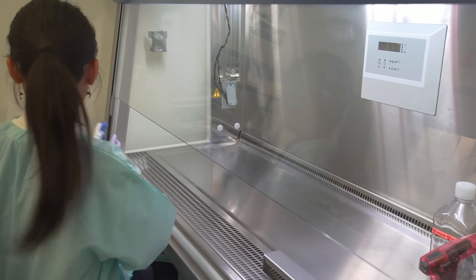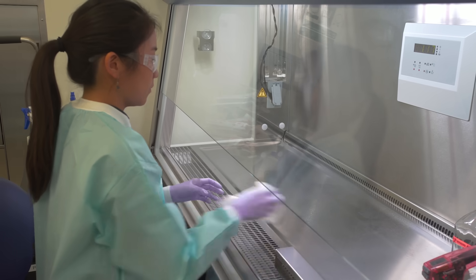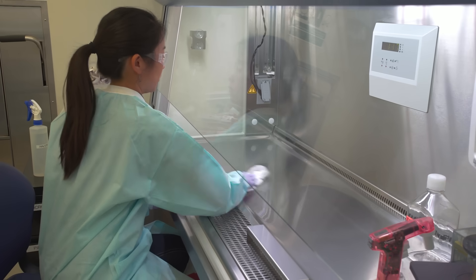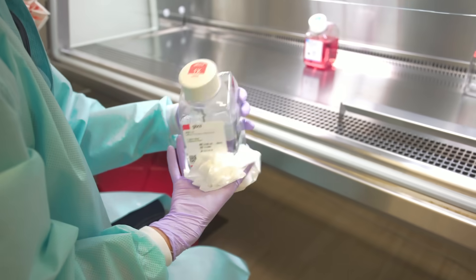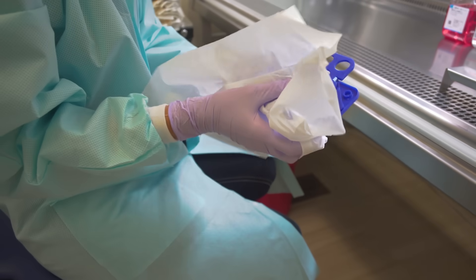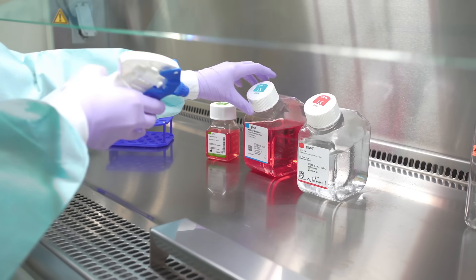Cleanliness is one of the most important parts of sterile technique. Always clean the hood before and after use. Spray alcohol should not be used in any area where a flame is being used due to the fire hazard. The outside of containers carry dust and contaminants, so remember to clean each item placed in the hood with ethanol. You may choose to spray the item before placing it in the hood or immediately after, as demonstrated.